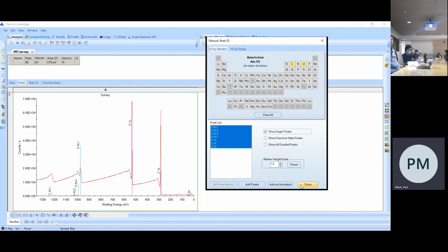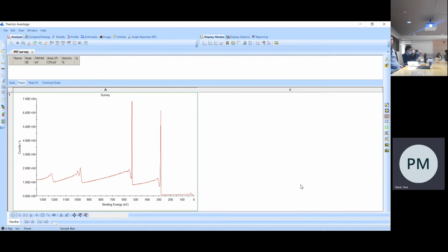to quantify the oxygen. But what you'll notice is that we have these peaks, but we also have this significant background which forms after each peak. On the right-hand side, you have quite a flat, low background, but after each peak, we have this relatively significant background that increases in intensity.